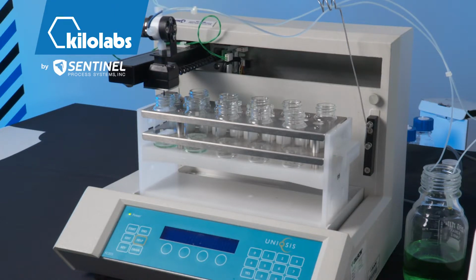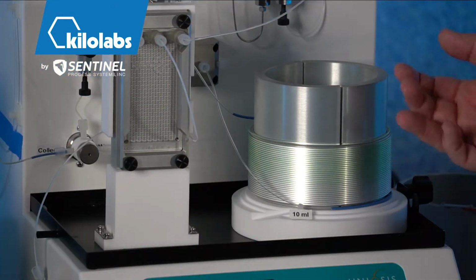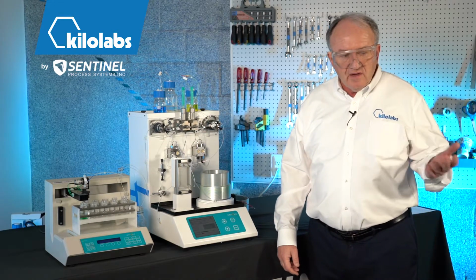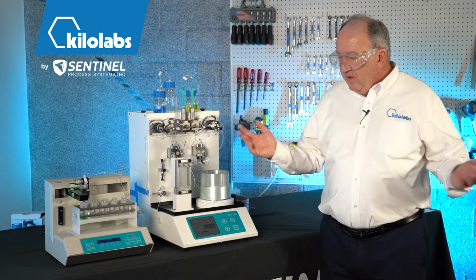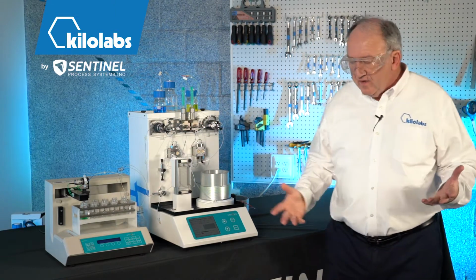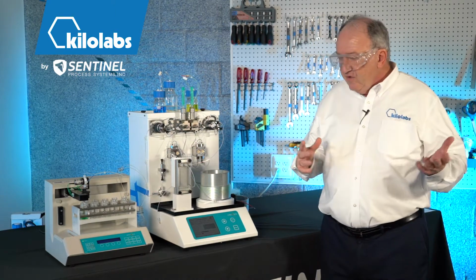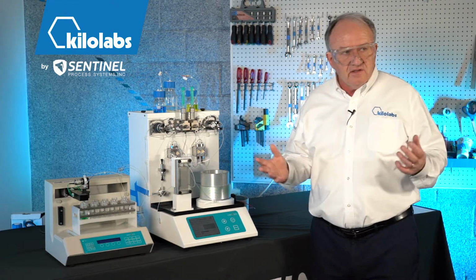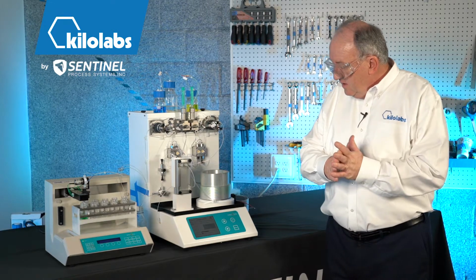The rest of the band of that set of reaction conditions is now being pushed through the coil, and we're collecting all that sample. That's a total of 4 ml that we committed per reaction. Again, that can be whatever number you want, up to the volume of the collection vial, which is 20 ml, or much smaller than that if you want. It depends upon how much reagent you want to commit to that particular reaction.